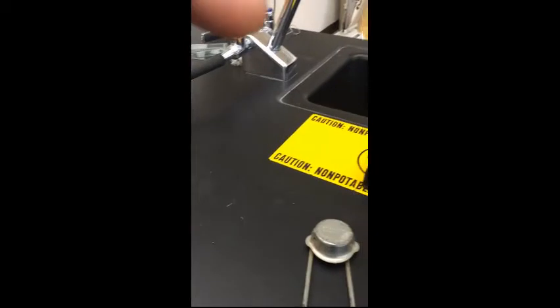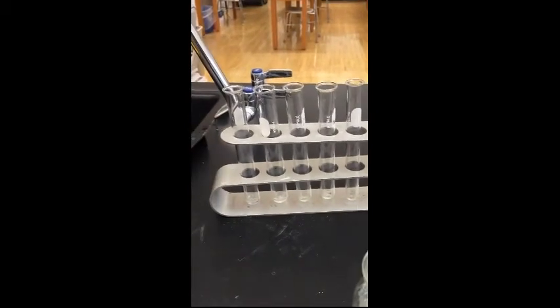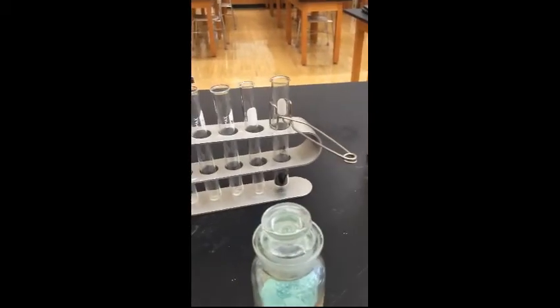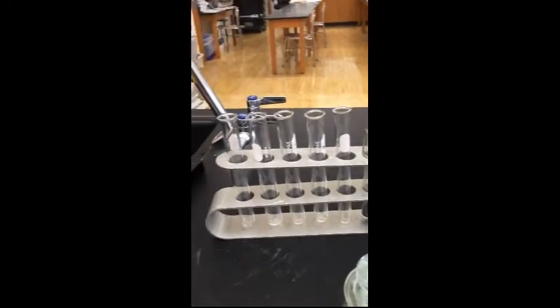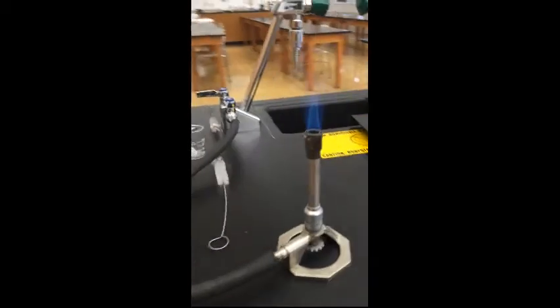I'm going to run some water. Get rid of that. I'm going to let that cool down for a while, and then I will scrub that out later. That's the decomposition.